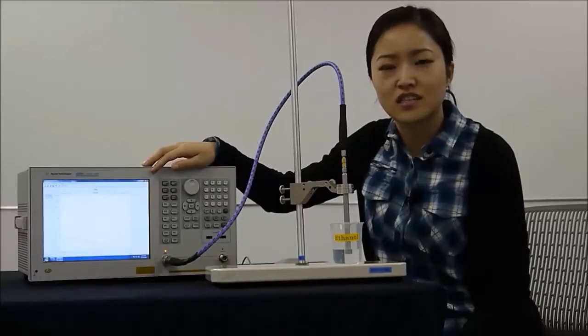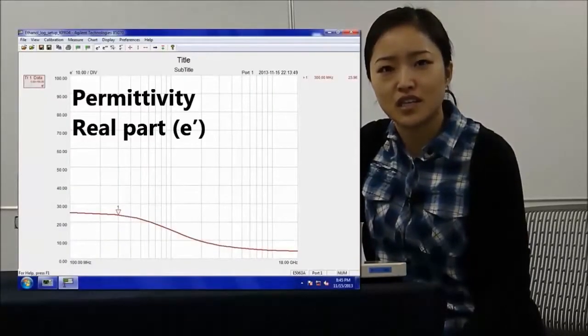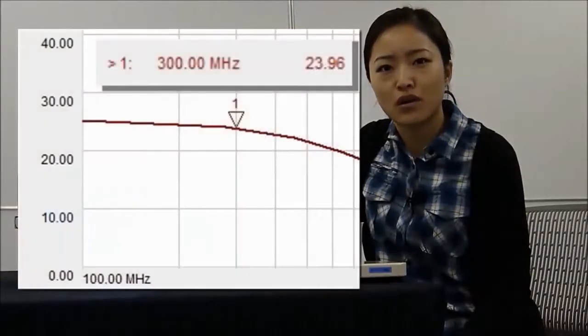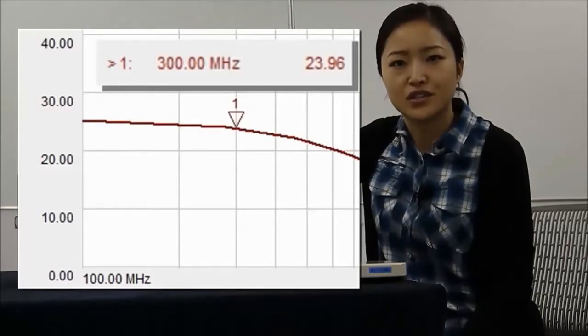Here we're looking at the real part of the permittivity, or dielectric constant. The typical value of ethanol is around 24 depending on temperature. We can see that the result is very close to typical.